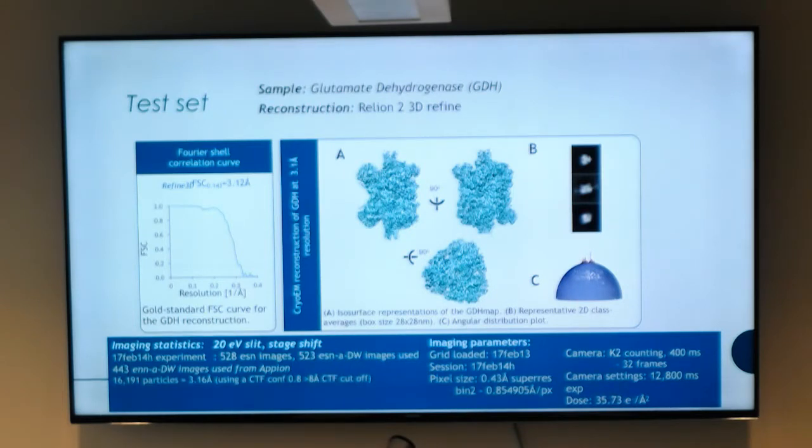So you can do that test on your own if you have time. But that's the main thing, is that certain things, if you have additional information, you might have to go back and rerun. CTF estimation is really quick to run, but it will take some time. If you have 2,000, 4,000 images, yeah, it might only take you a second per image, but now times 4,000. So that does take some time.